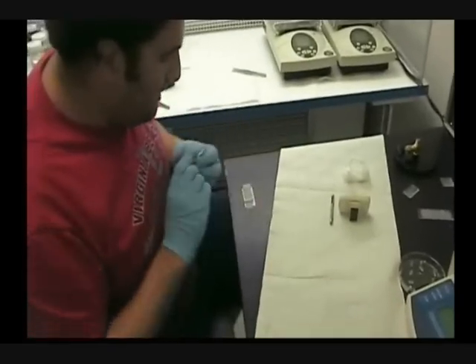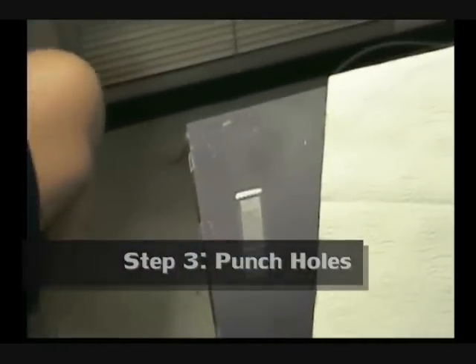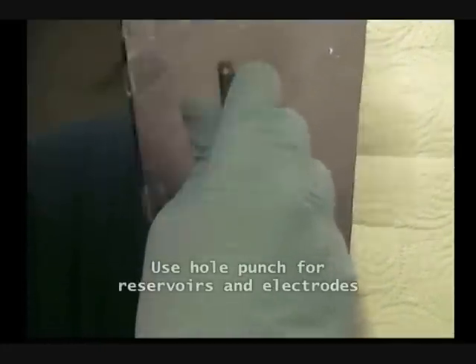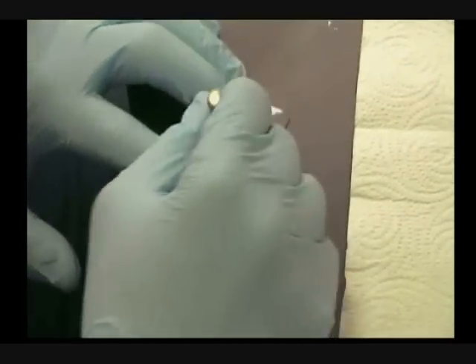Now the next step, we are gonna punch the other side. So the holes are — holes can be seen. I'm gonna cut the other side.